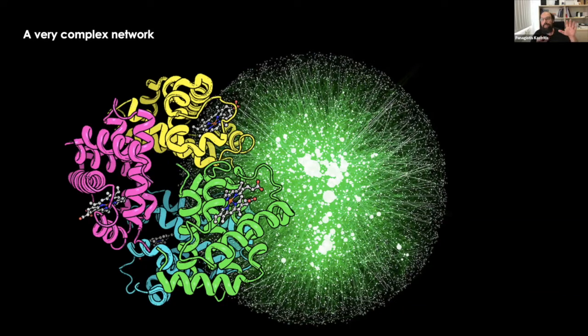So basically, we have in situ or in-cell structural biology that is emerging, that can see structures of individual molecules of extremely high abundance, the ones that we know how they look like. And then we have our in vitro structural methods to understand how a specific protein of interest looks like.